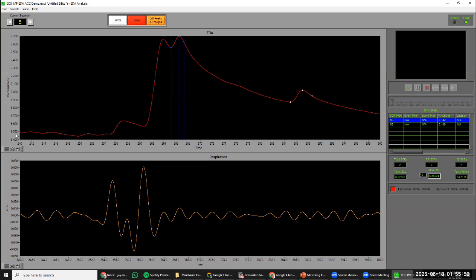But in some cases, we want to be conscientious of this, if we're going to be looking at something like tonic skin conductance level. By removing these points here, we are saying this is a tonic period in which we're not having those functions, which could be fine here. But comparing to this phasic component, did we actually want to do that? Is this truly a tonic period? Those are things that need to come into consideration if we're looking to report on tonic SCL and tonic periods.